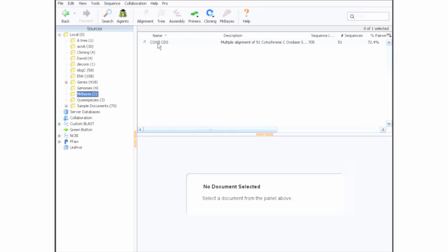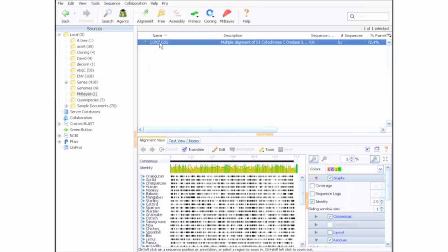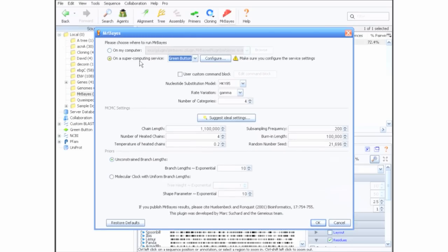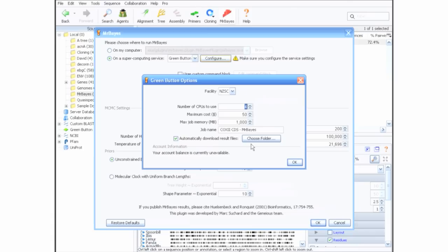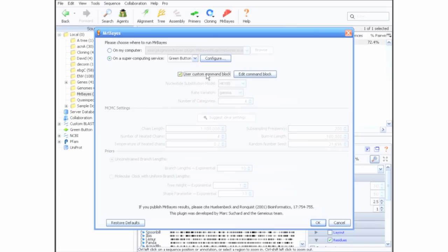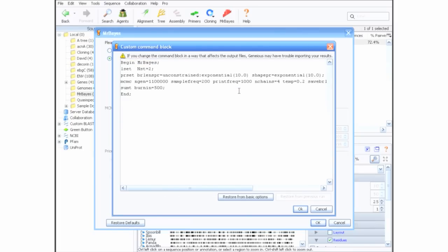Select the alignment you want to use for your Mr. Bayes job and click Mr. Bayes in the toolbar. At the top of the options, choose to run your job on Green Button. You should always click on the Configure button to set some important options for your job. In the latest version of the Mr. Bayes plugin, we have made it possible to specify a custom Nexus command block, making the full power of Mr. Bayes available.